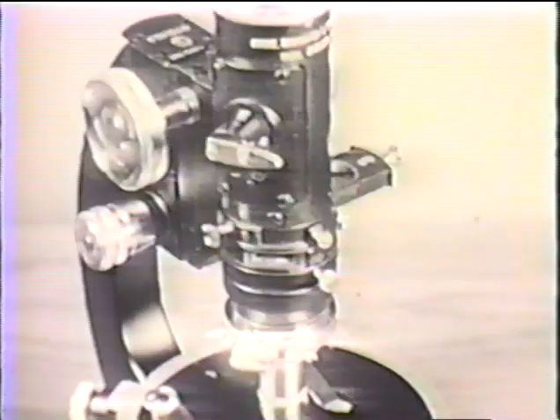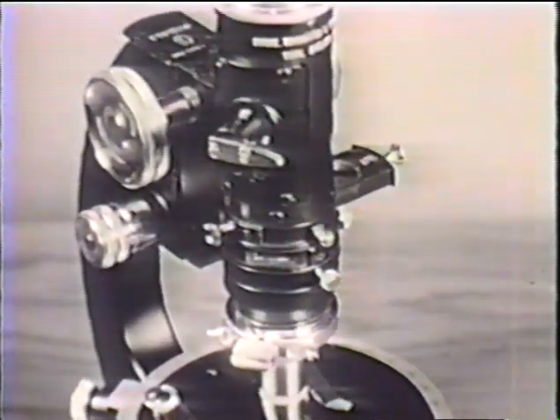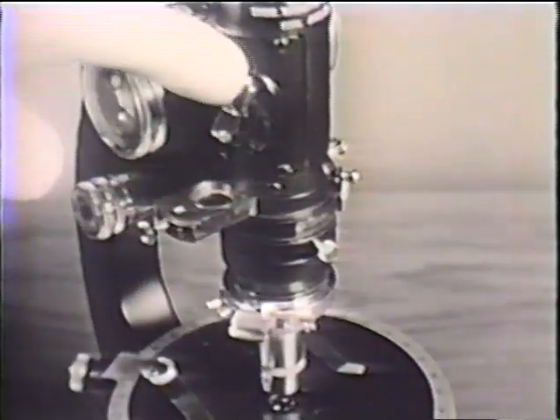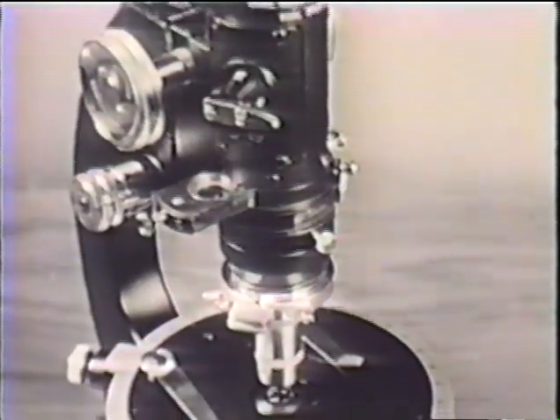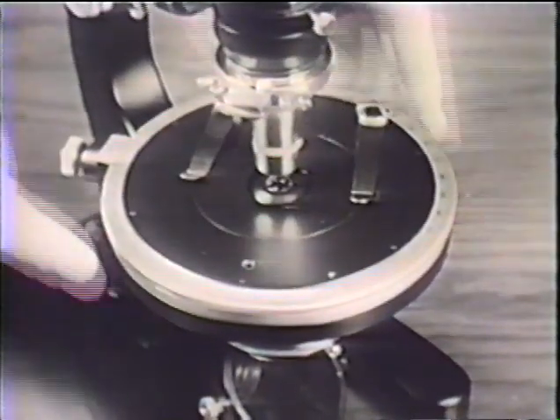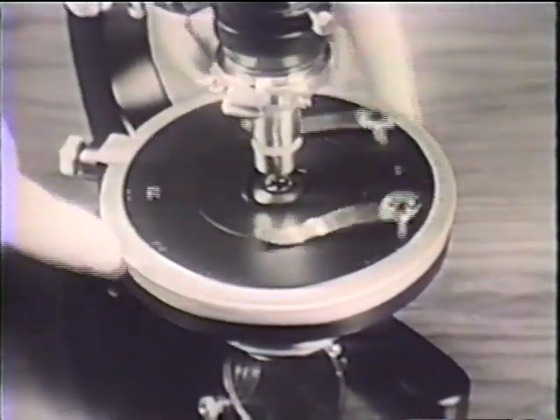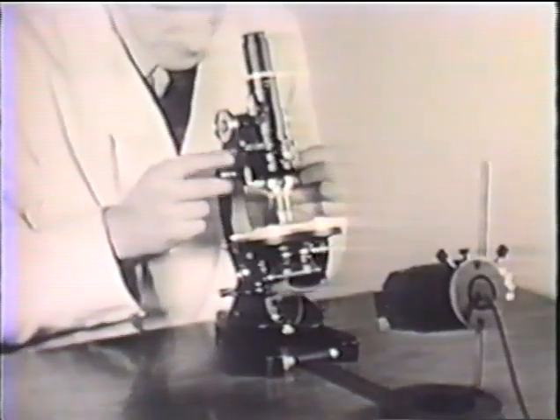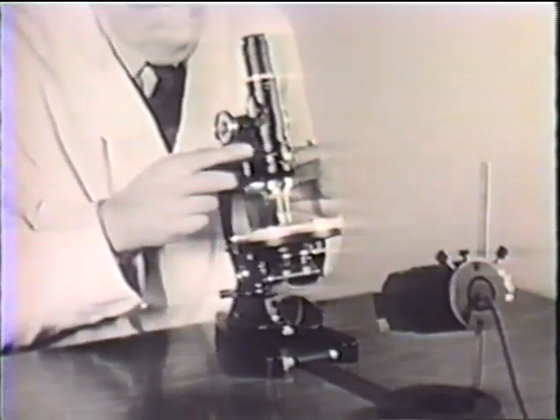The Bertrand lens can be brought into the tube so the image of the back aperture of the objective is formed in the eyepiece instead of the object. A graduated rotating stage must be fitted so that angular rotations of the object can be measured. First, we'll remove the polarizing equipment and use ordinary light.